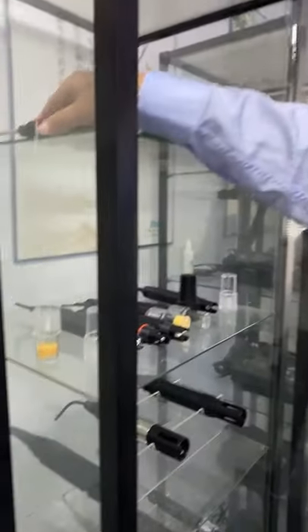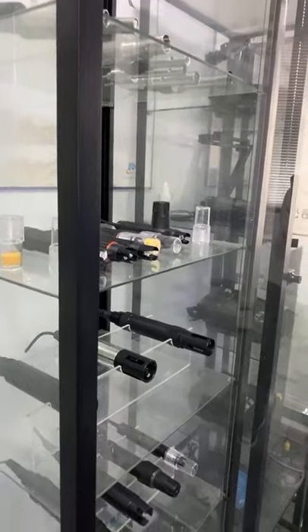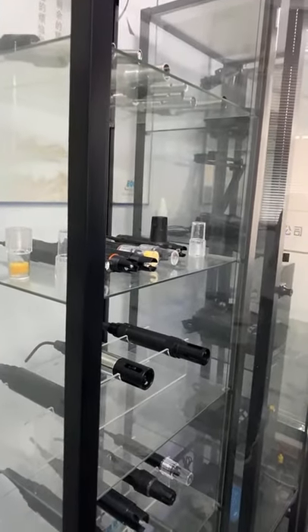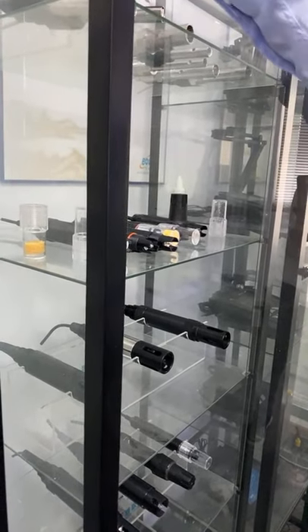Now we introduce the conductivity sensor. A conductivity sensor is similar to a pH sensor, with many applications: pure water, wastewater, and fermentation or sterilization applications.